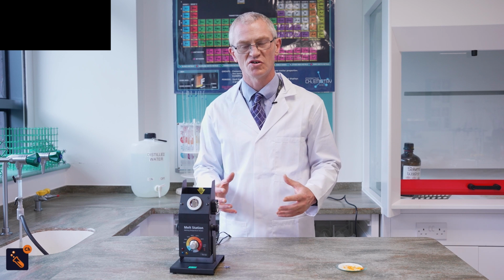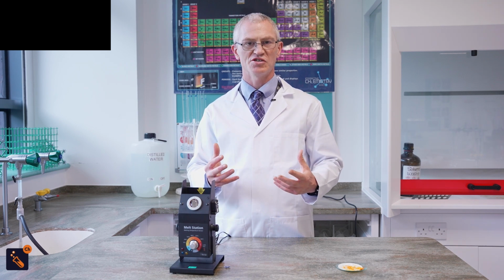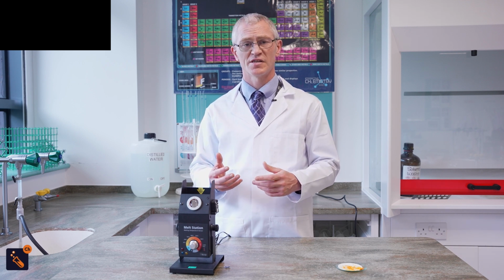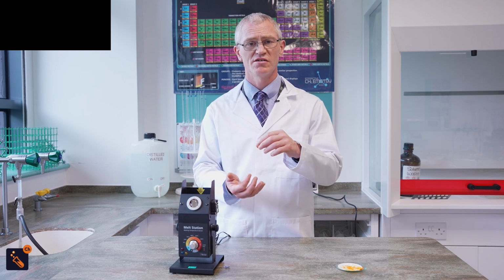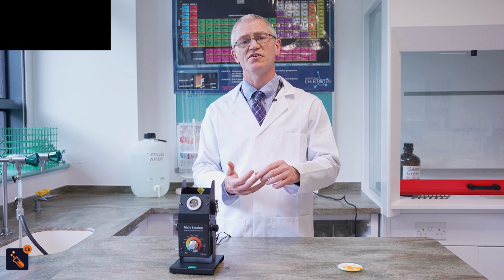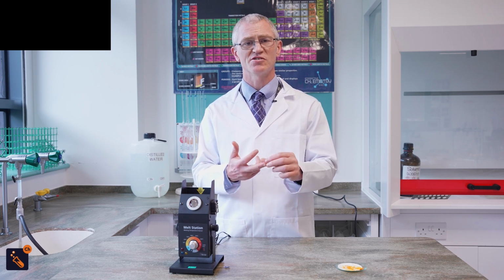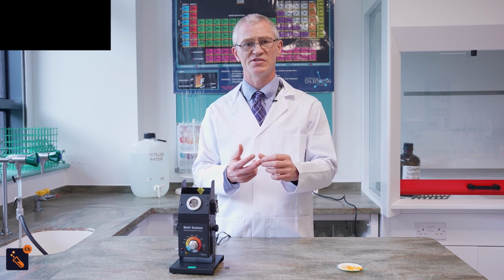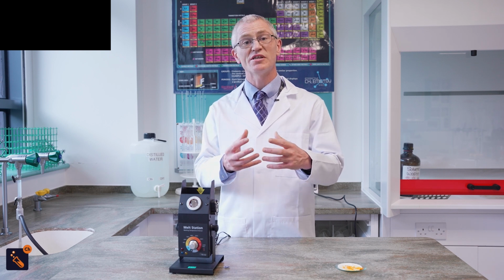So now we've gone through all the stages of doing a 2,4-DNPH test and using that to identify a ketone or an aldehyde. The stages, just to go over again, are recrystallization, then you filter, and after that you take the melting point and compare it to a database of known melting points of 2,4-DNPH derivatives. And we're now going to go back to the studio so that we can put that in the form of an exam question.